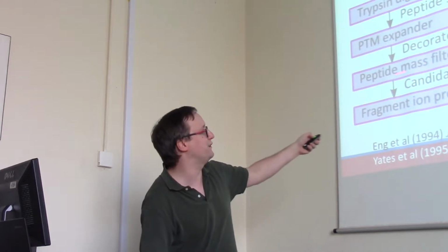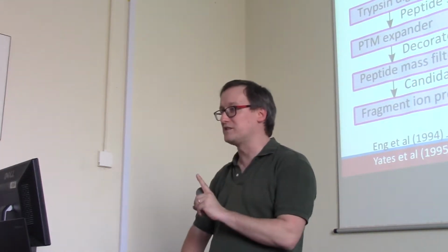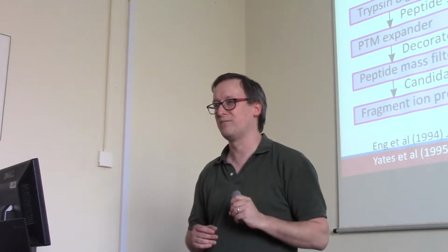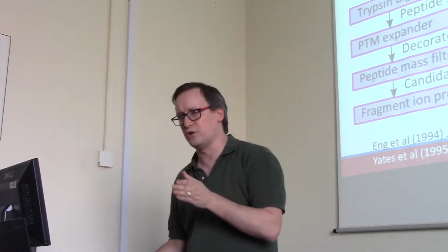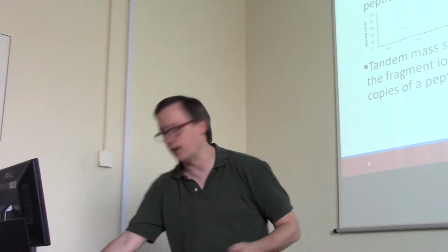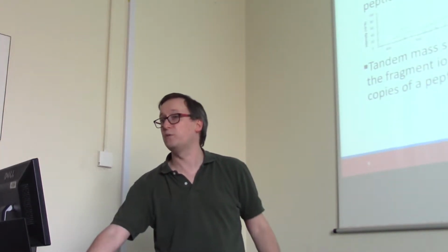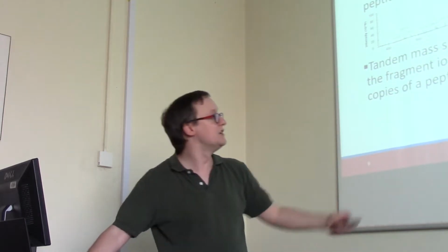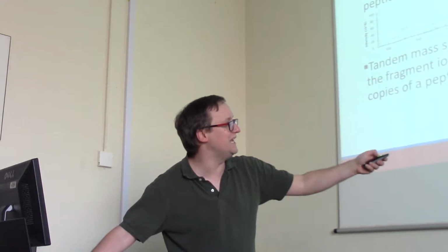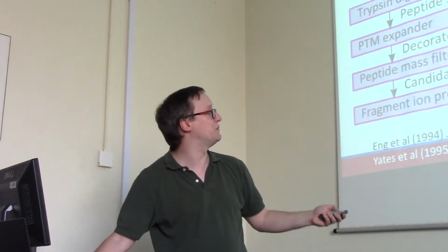The peptide mass filter is the key to our knowing which sequences should get compared to which tandem mass spectra. After all, just a moment ago we were looking at a tandem mass spectrum, well, right here. Remember we had our precursor measurement? That precursor ion is the thing we blew up to create these fragments. So I know that this one has a mass to charge value of 898.92. This is where we're going to put that to work.